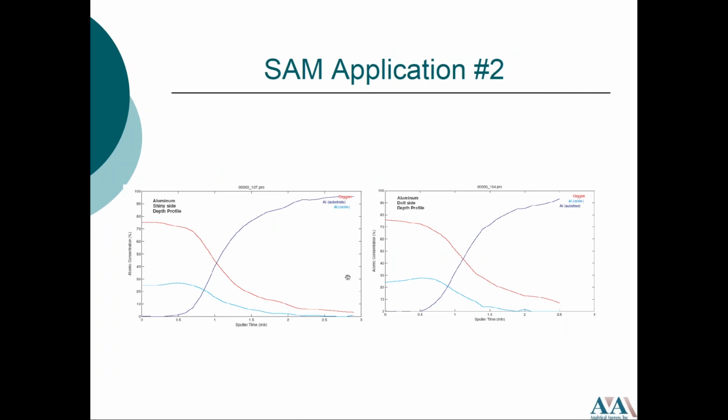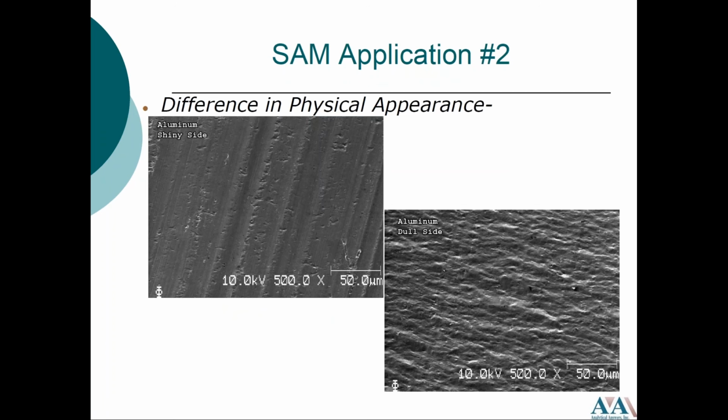So here's just a quick review of all that we talked about today. Our first example was the surface contamination and understanding the chemistry of any discoloration you may find on your surface, and ESCA is the ideal technique to do that. You can understand chemical bonding as well as everything that may be on the surface. The second thing we talked about were surface coatings and treatments as it applies to adhesion. There you can use ESCA because it's able to analyze insulating materials, as well as if you wanted to analyze if you functionalize the surface of your material, ESCA is an ideal technique to use.